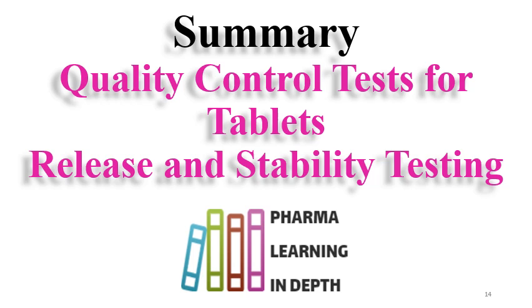So I hope this video will help you to understand the quality control tests for tablets for release and stability testing. Generally, release testing means the tests on finished formulations performed to release the batch into the market, and stability testing are the tests which are done on the finished formulation during the stability intervals to prove the stability of the formulation, and also to give the shelf life and storage recommendation for the formulation.